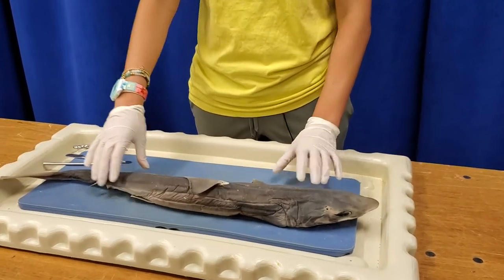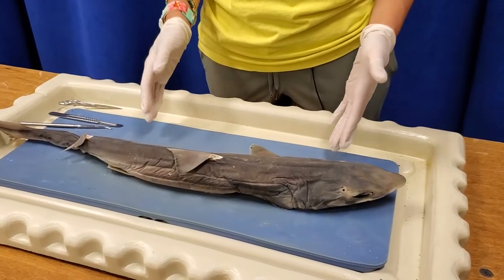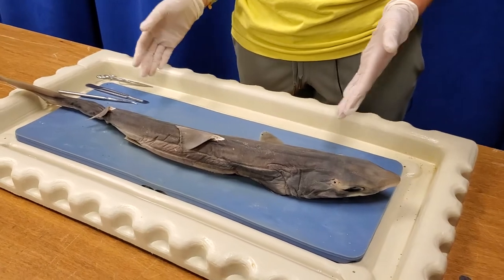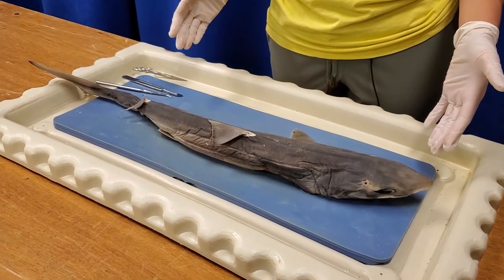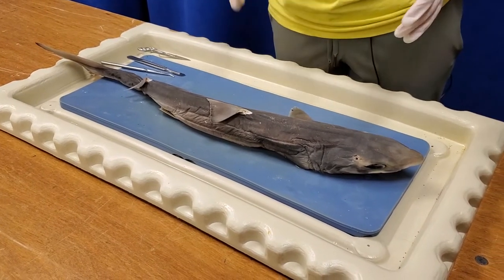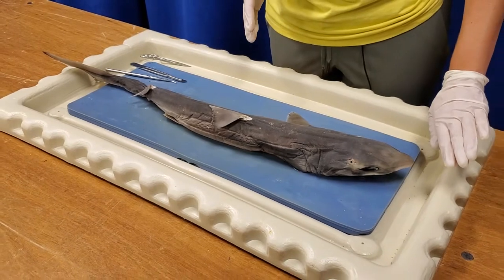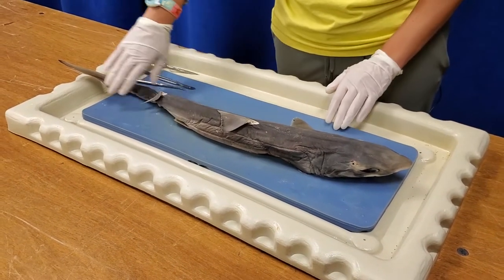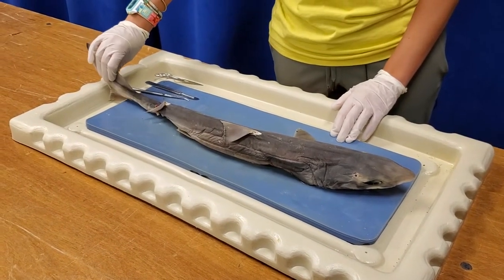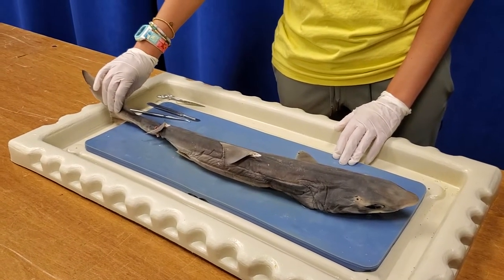On the outside there are a few things to note. When looking at something anatomically, there are a few special terms. First, we have the rostral and caudal ends. The rostral end is the forward part, whereas caudal is the back. The tail fin is also called the caudal fin, and it's important for generating movement for swimming.